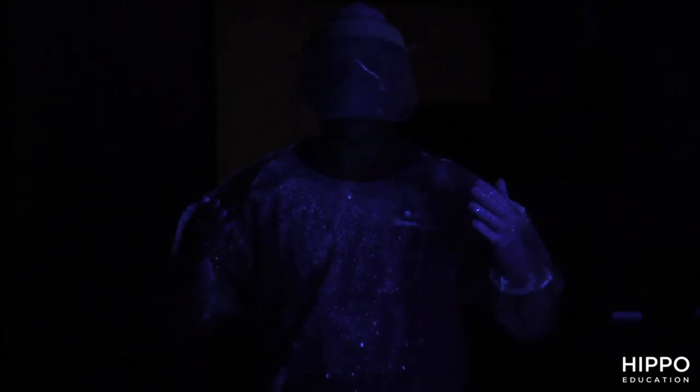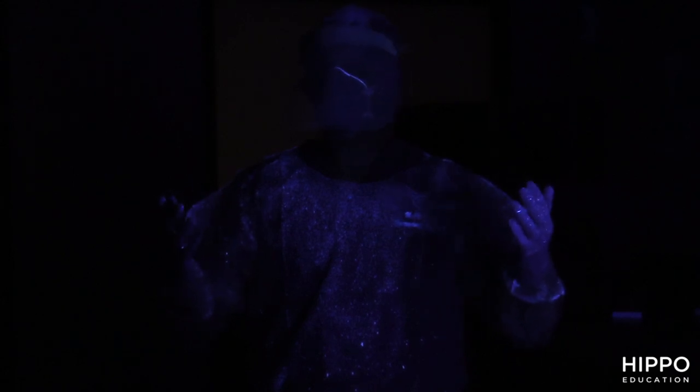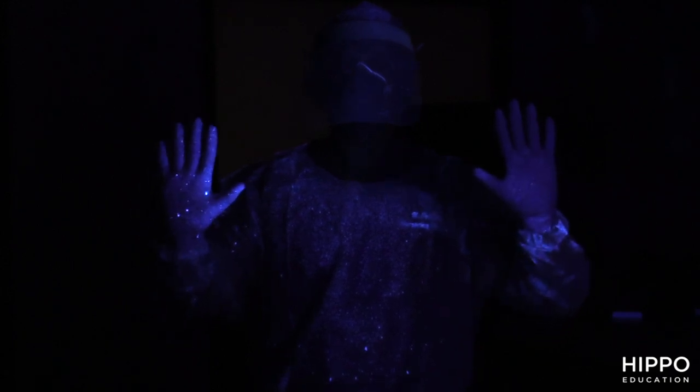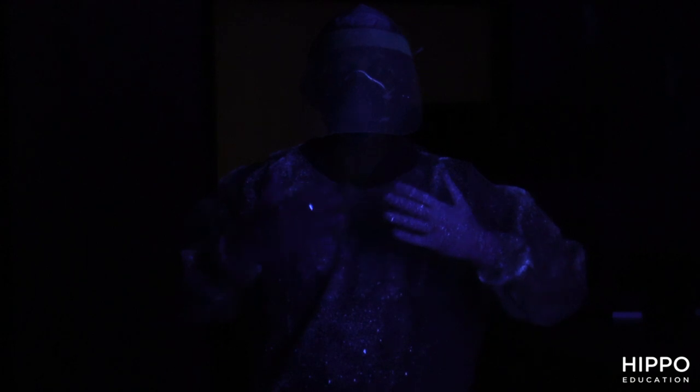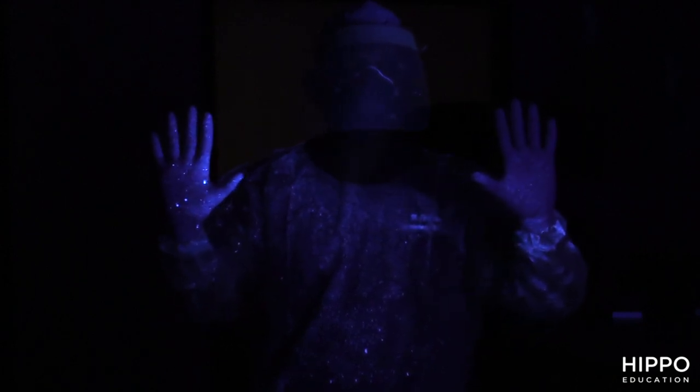Now that we have the studio lights down and we have our black light, you can see the luminescent material — the contamination on my PPE — mostly focusing on my hands, my face mask, and my torso, because that's really the part of your body that is most exposed, especially the hands when you're in with a patient.